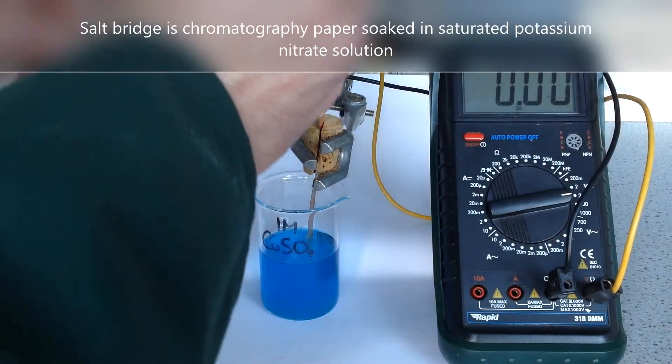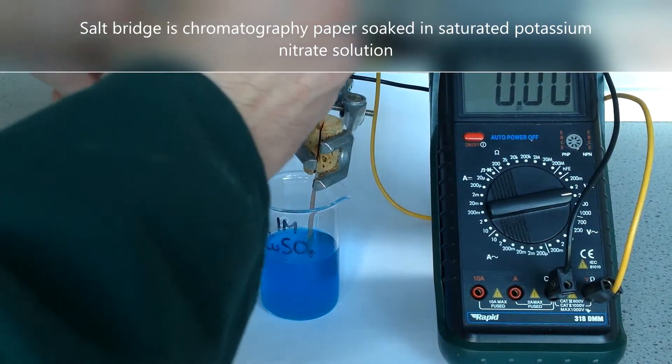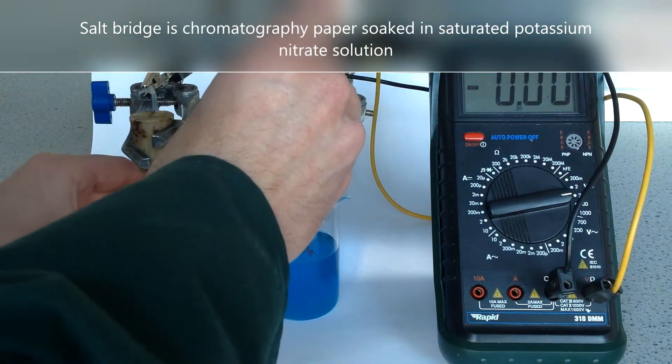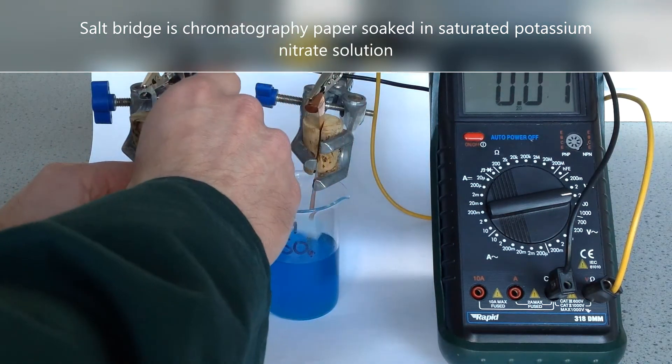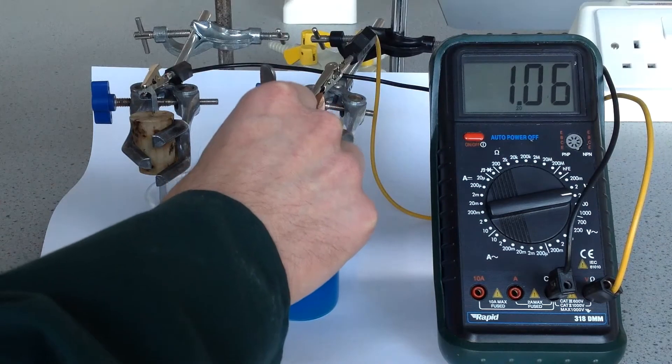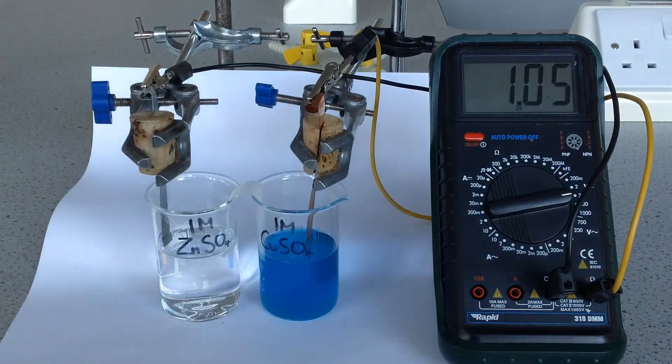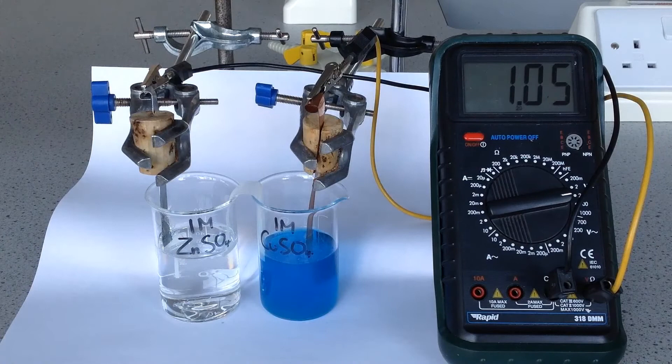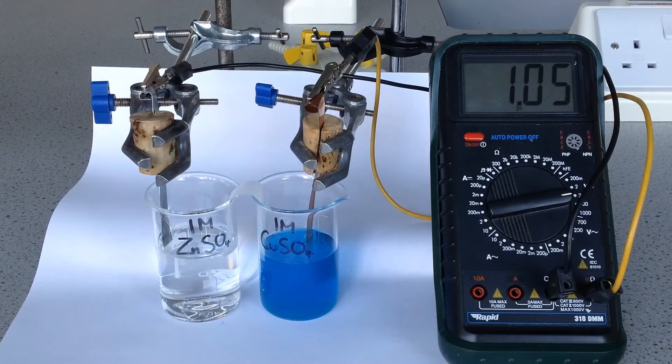When we add our salt bridge across, it's a bit fiddly when you're doing it, you just need to make sure it's in contact with both solutions. And when we do, we see a reading on the voltmetre of 1.06 or 1.05 volts in this case.